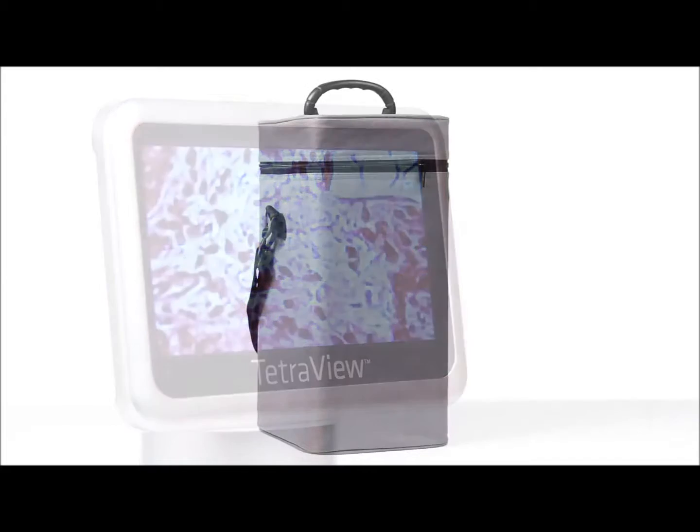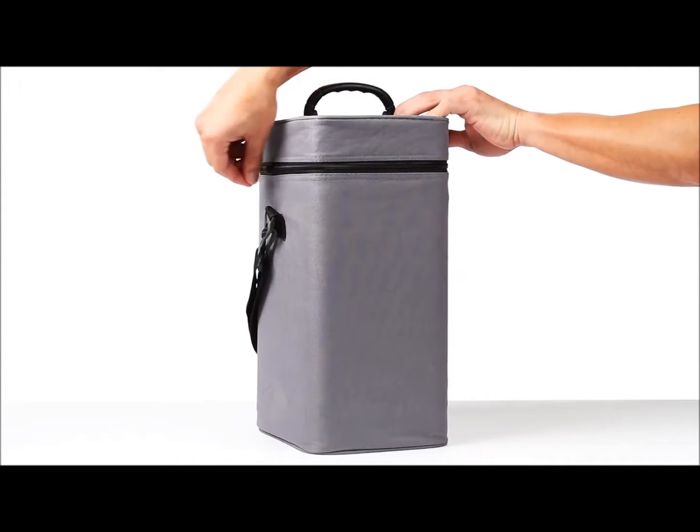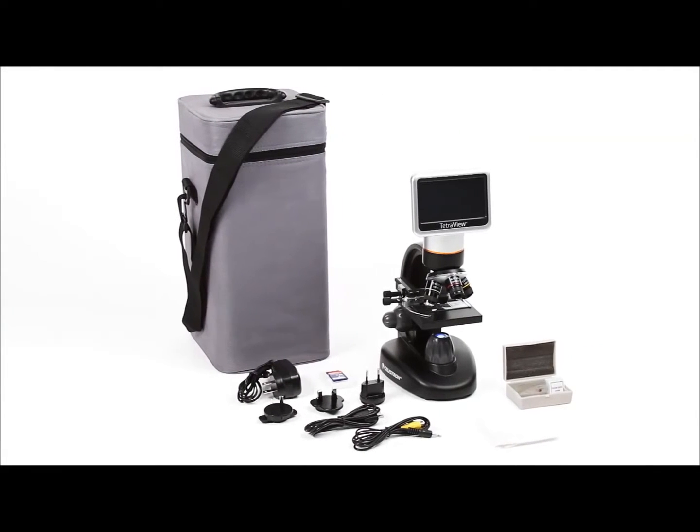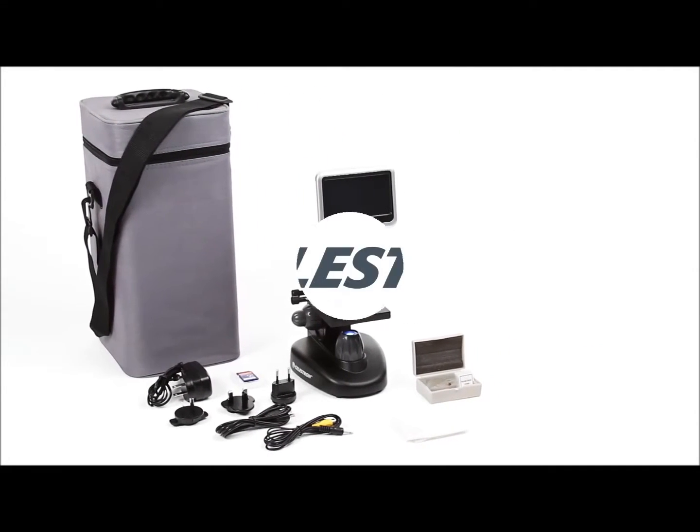Take your microscope into the field with the battery power option and hard carrying case. TetraView comes with a variety of accessories, including a stylus and prepared specimen slides to get you observing right away.